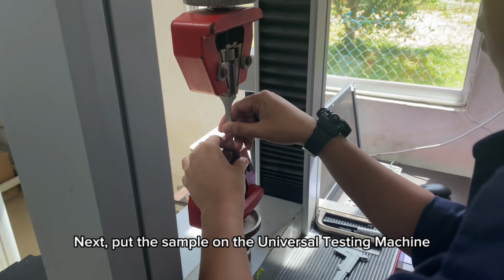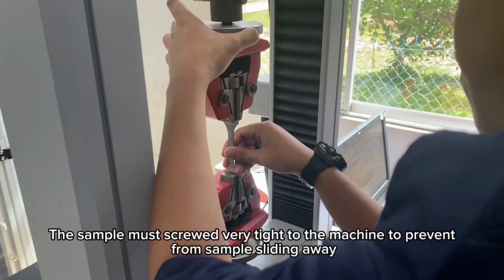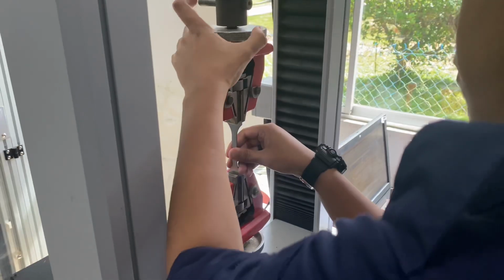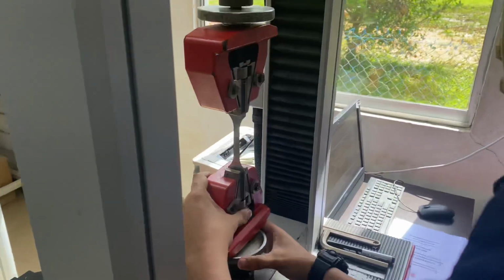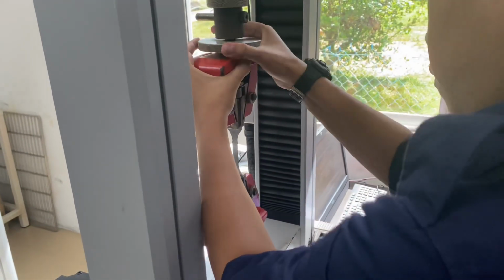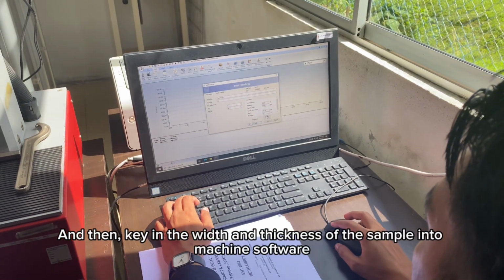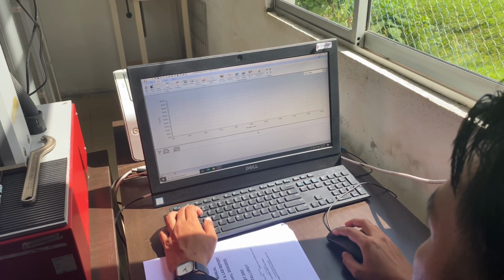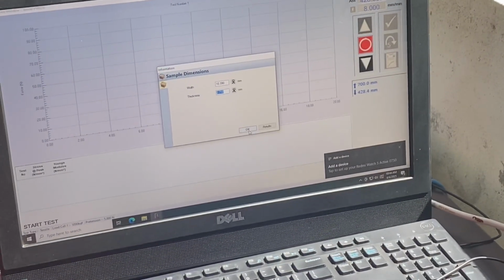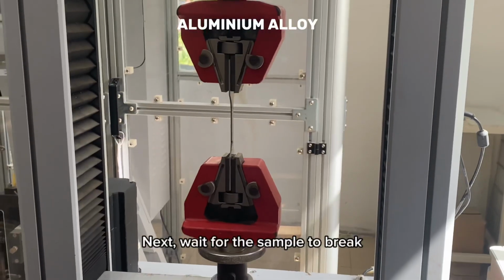Next, put the sample on the universal testing machine. The sample must be screwed very tight to the machine to prevent the sample from sliding away. And then, key in the width and thickness of the sample into the machine software. Next, wait for the sample to break.